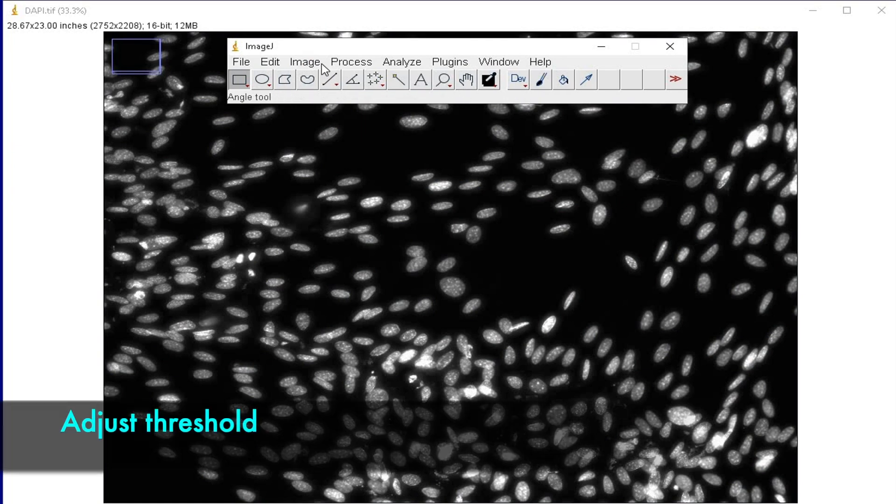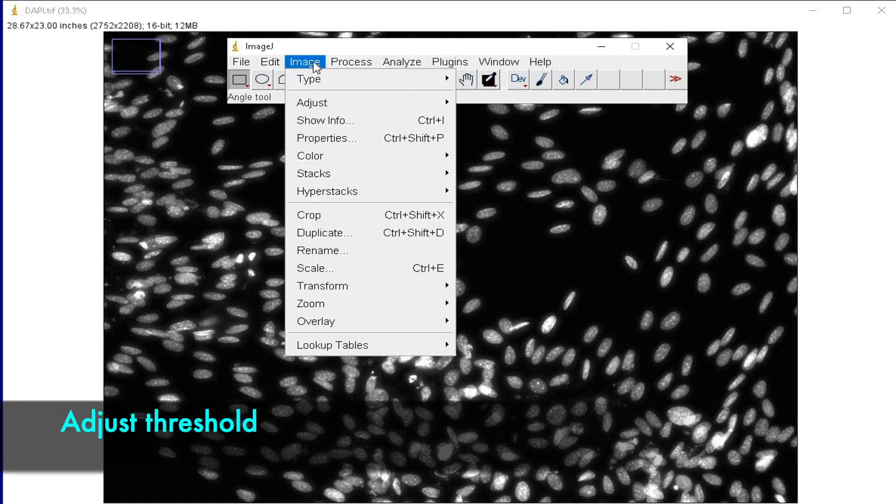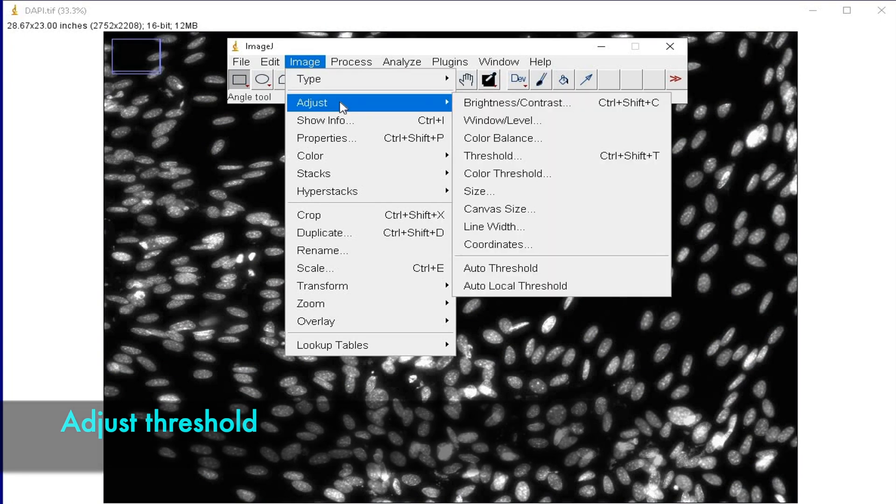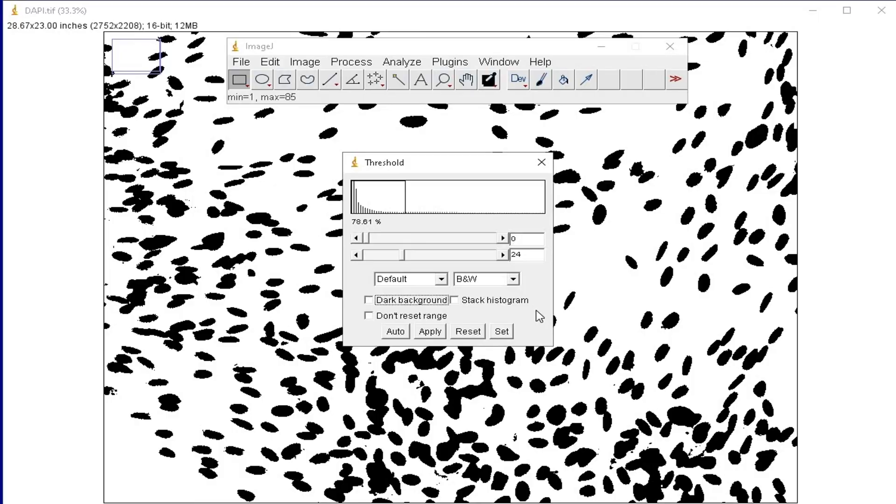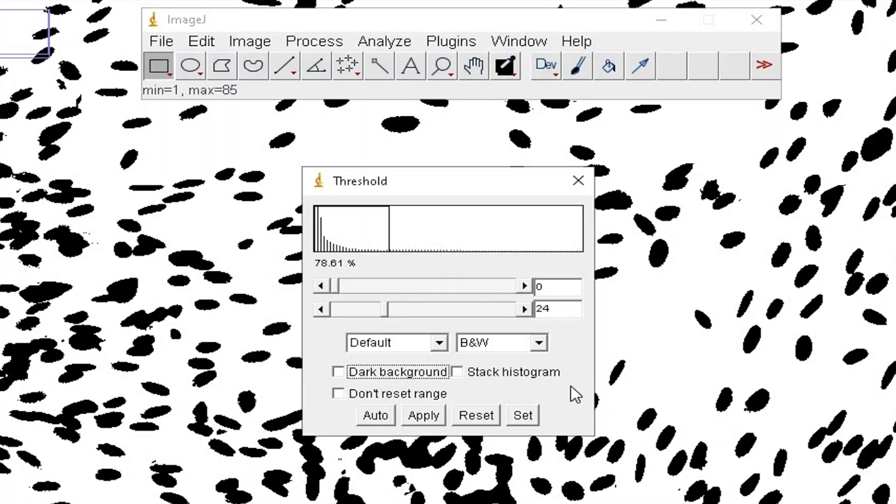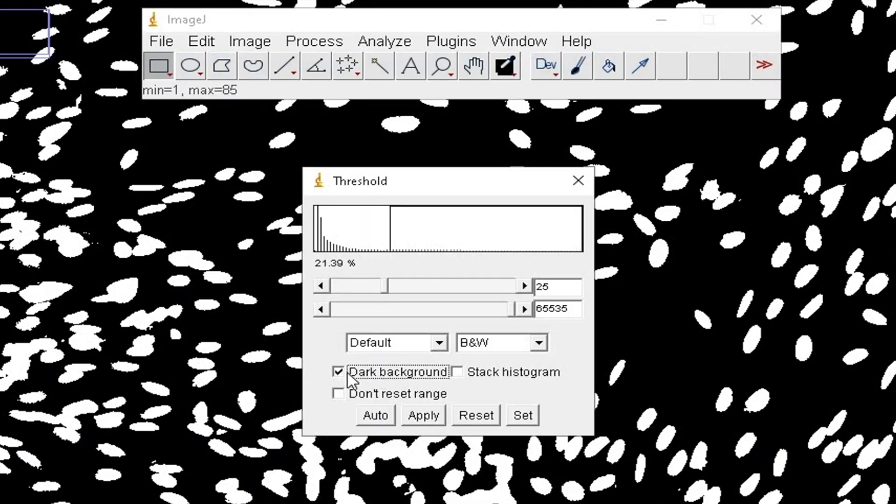Next, adjust the threshold by clicking on Image, Adjust, and Threshold. For example, check on the option Dark Background and change the color to red.